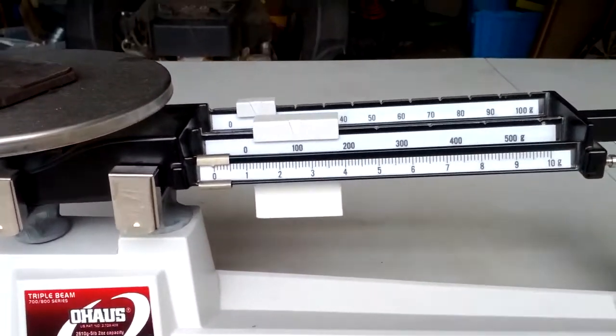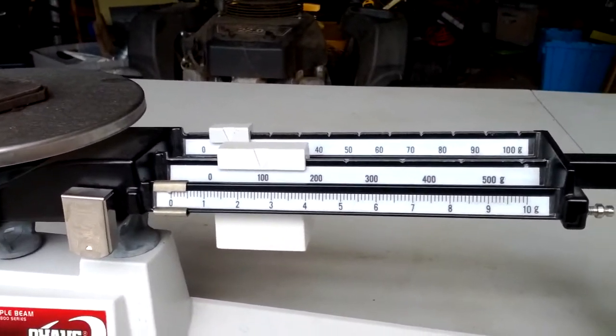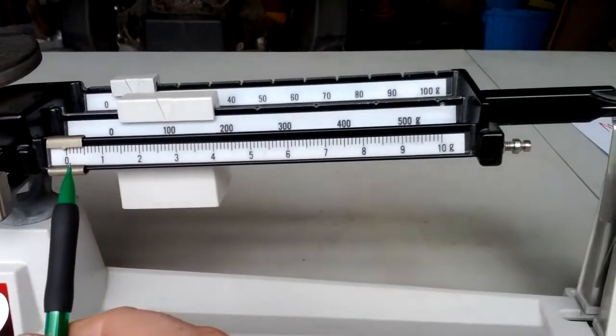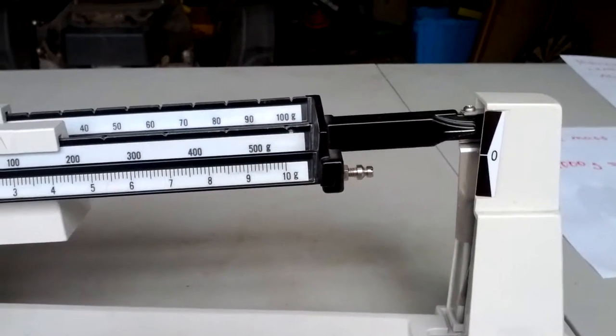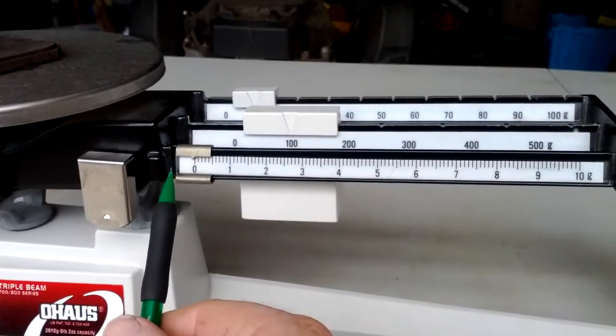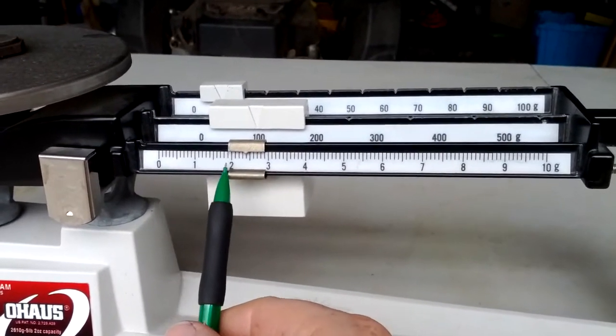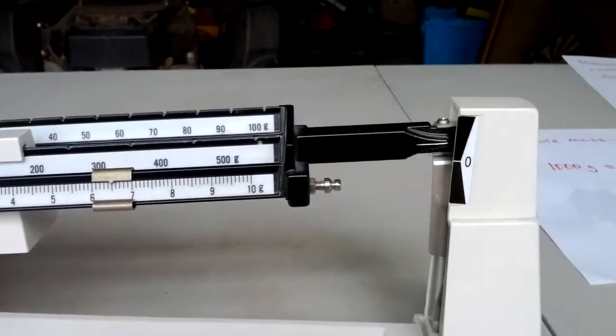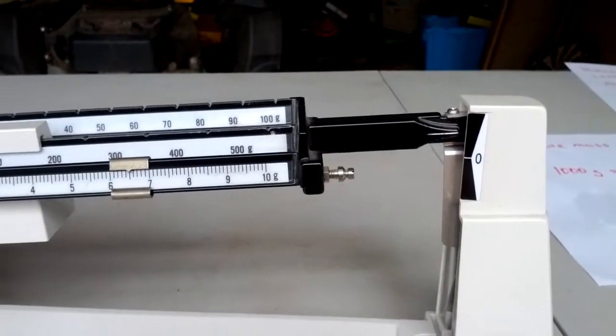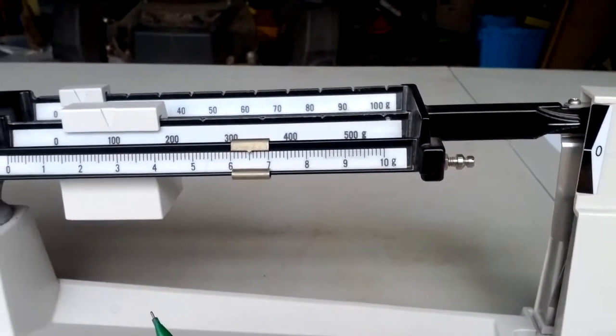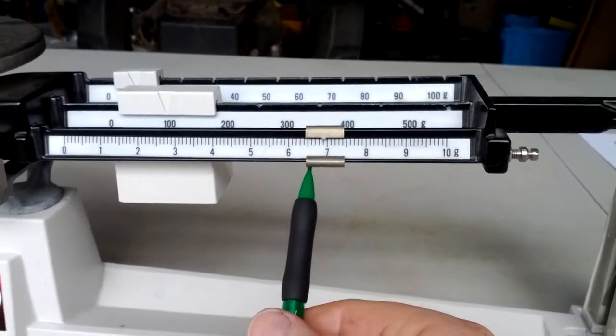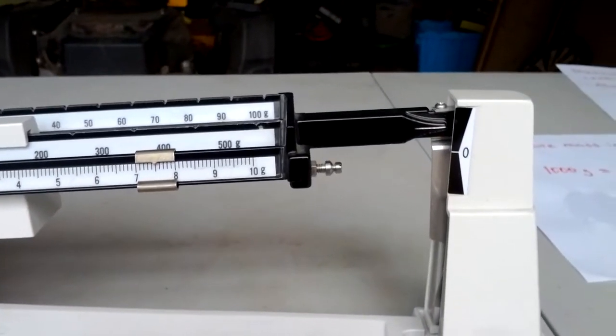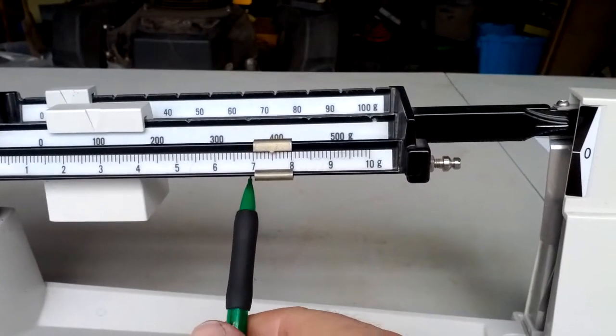What you do next is you use the small rider. And you're going to move it over a little bit at a time until you get right to the zero on the balance. The best way to do this is with a pencil. So you're going to slide it over a little bit at a time. And each time you slide it, you have to look over here and see if you're getting close to zero. We're already over to like 6.5 and it's not there. So I'm going to slide it a little bit more. I'm at 7.5 and it's still not at zero.